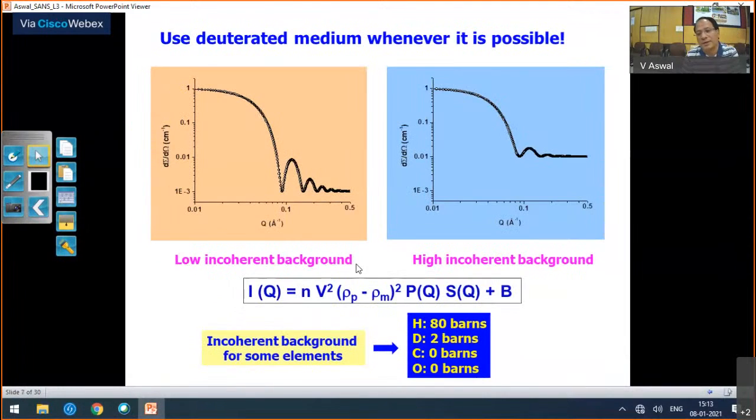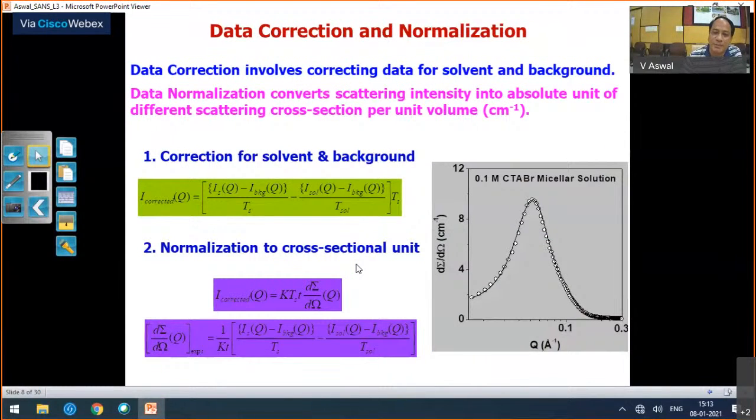So this was about how you prepare correct samples for your SANS measurement. One thing is that you should take the right thickness, because that will maximize the intensity from your samples. Then in a given beam time, you can measure a larger number of samples. Otherwise, you may have higher incoherent background, or you are able to measure only fewer samples with proper statistics. And also you should select the proper constituents so that you have a good contrast in the samples.